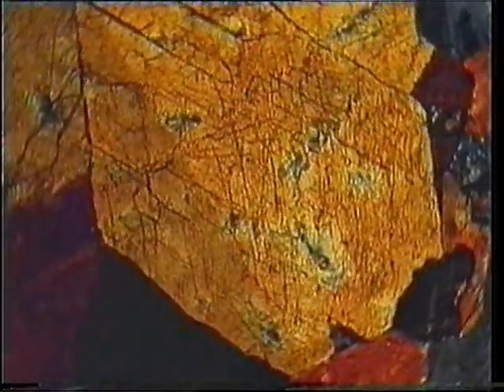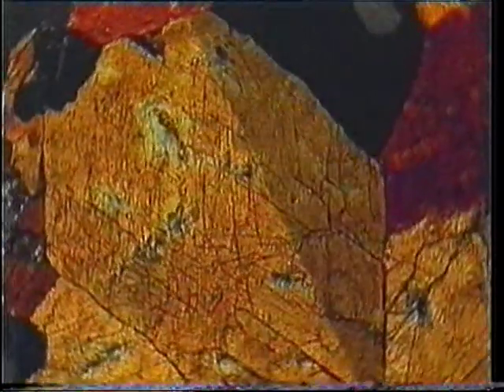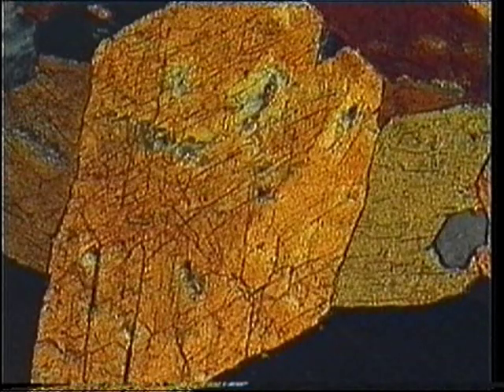Some grains show straight internal grain contacts which are thinner than normal grain contacts. Note the different extinction positions for the two parts of this grain on either side of the contact. This represents the trace of a simple twin plane which bisects the acute angle between the cleavage traces.